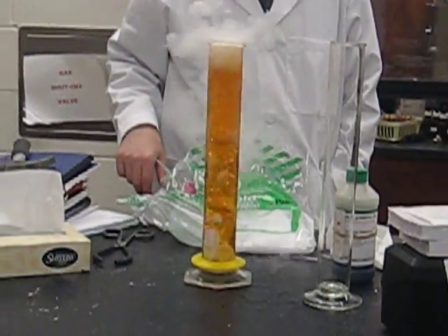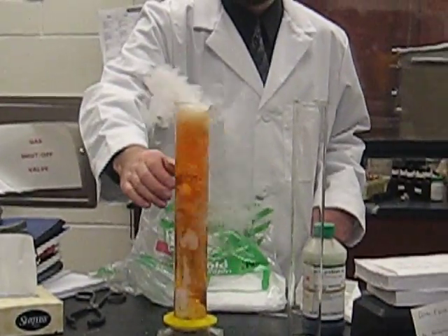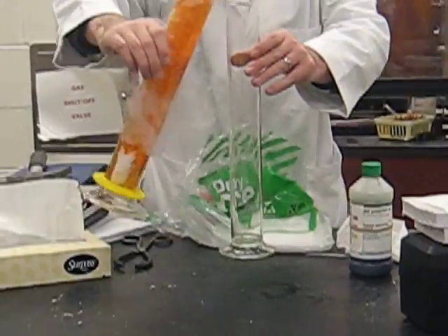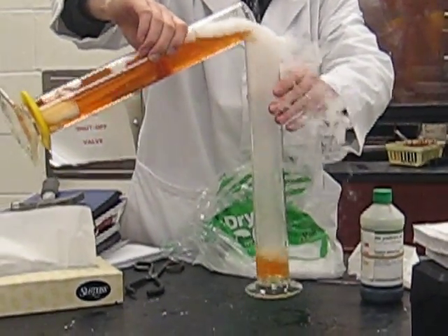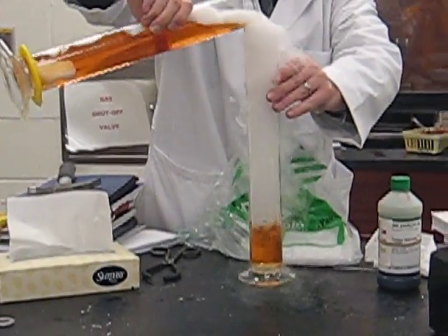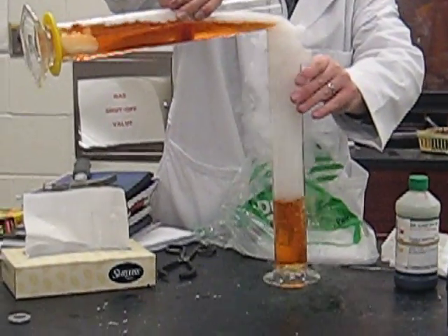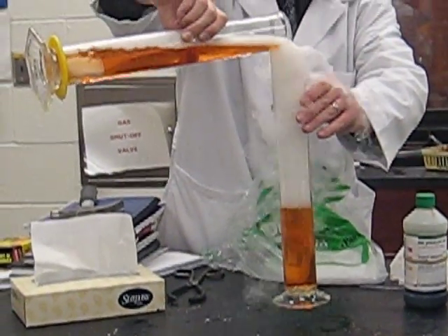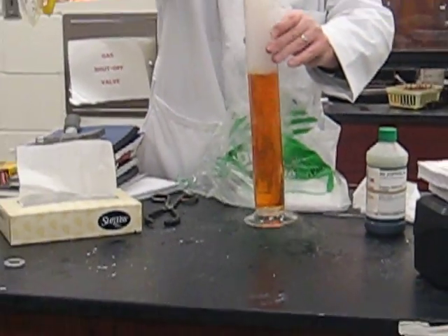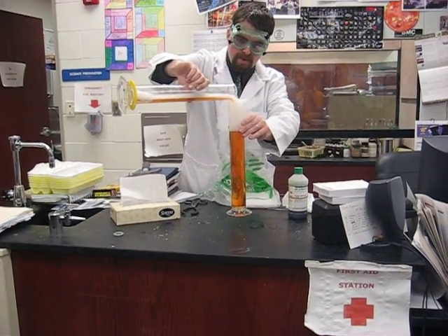Orange. It is splattering a little. Now this won't go quite to red because carbonic acid is not a strong acid. Carbonic acid is in pop — he actually drinks it every day. About four Dr. Peppers a day.